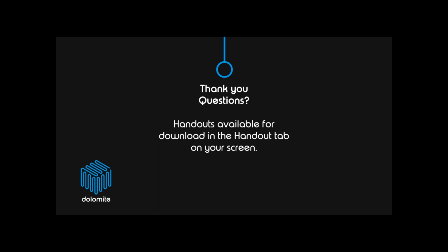Usually we would recommend using a Malvern Zetasizer because they've proven to be quite reliable and they're used worldwide by most leading laboratories, and that's something that we use as a characterization technique as well. As well as DLS, I would suggest that you also do some image analysis of your particles, such as TEM and SEM, for comparison and morphological purposes as well.